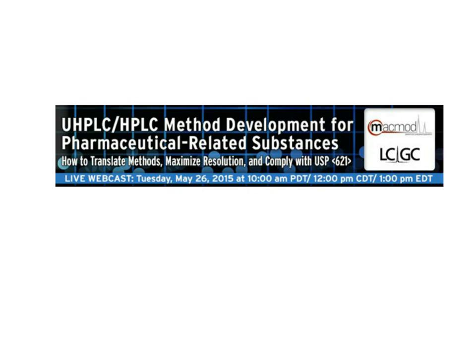UHPLC and HPLC Method Development for Pharmaceutical-Related Substances: How to Translate Methods, Maximize Resolution, and Comply with USP Chapter 621.